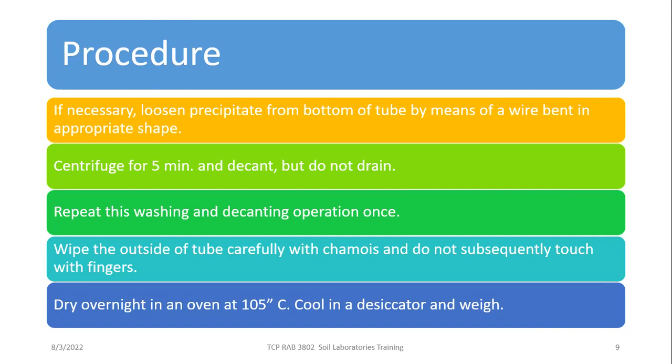For this reason, I really encourage using spectroscopy rather than the process of weighing. But in general, this procedure is well known, and it is also similar to the methodology used for gypsum determination.